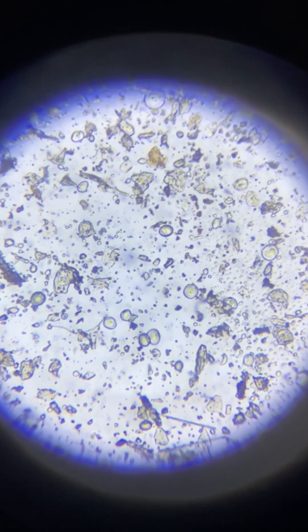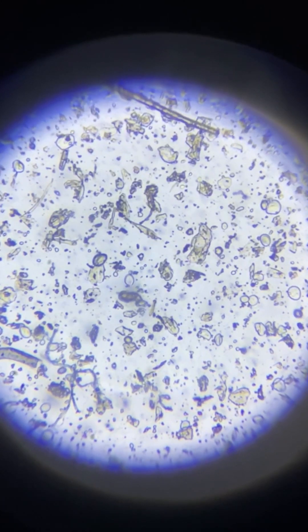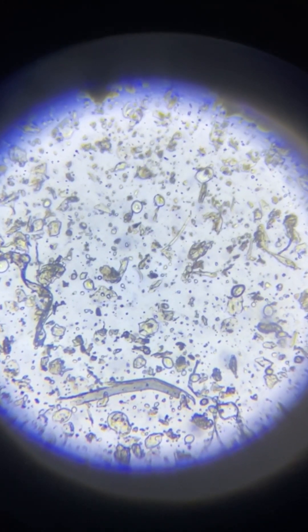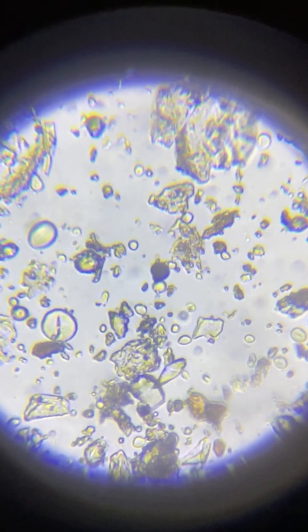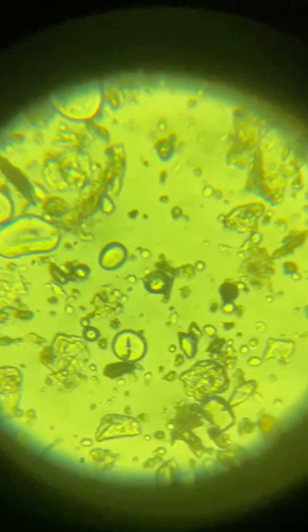Anything? No, we're going to keep searching because I promise you there's one of them in here. You've got to look out for them because they will fly by. Keep searching. I don't see anything. Let's get a closer look. I'm going to get a closer look. Let's change the lens. Nothing, nothing.